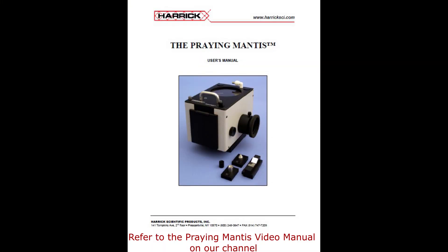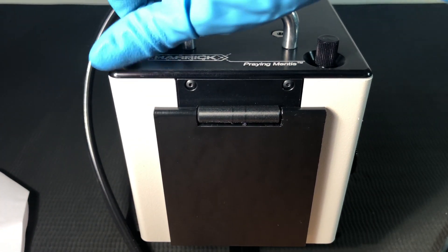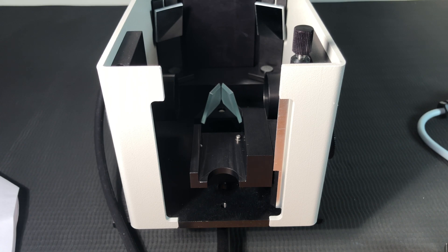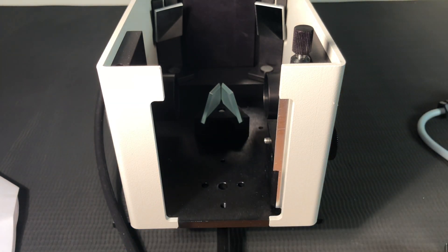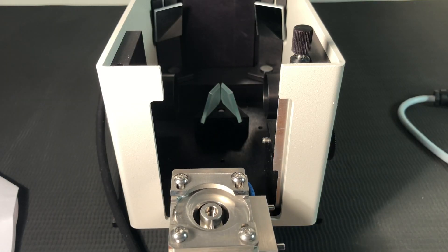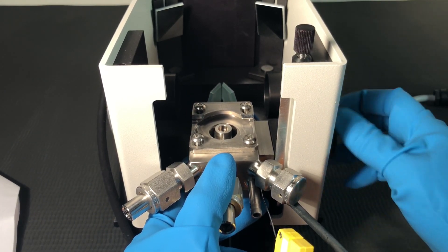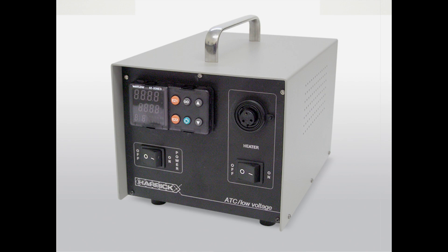Before installing the HVC in the Praying Mantis, make sure that the Praying Mantis is aligned in the spectrometer. Unscrew the thumb screw on the top plate of the Praying Mantis and carefully swing the top plate out of the way. Grasp the sample stage and unscrew its mounting screw. Locate the mounting pins on the side of the HVC and place them in the pin holes where the sample stage was located. Reinstall and tighten the sample stage mounting screw.